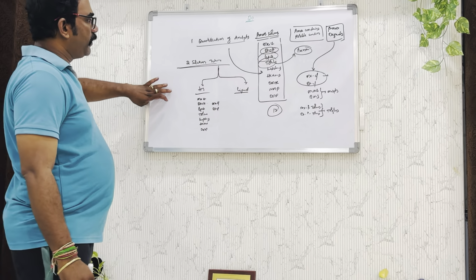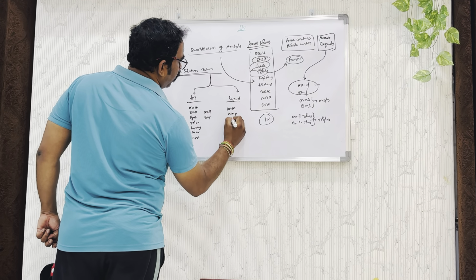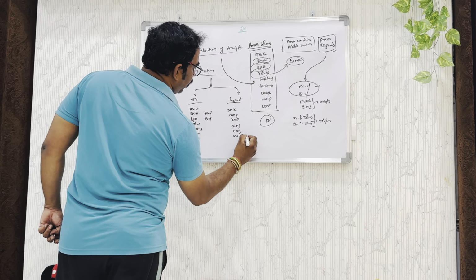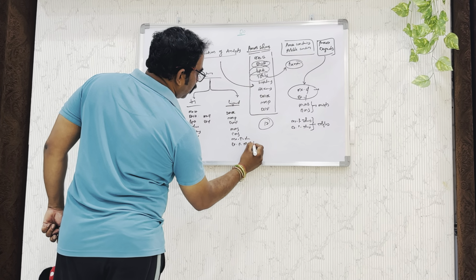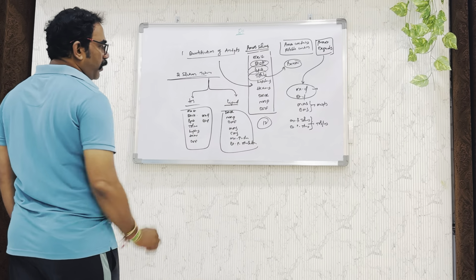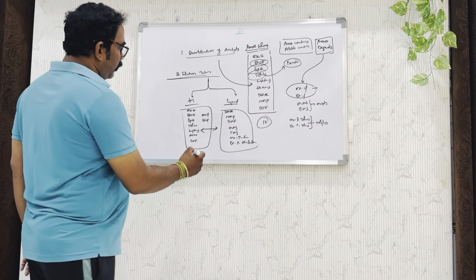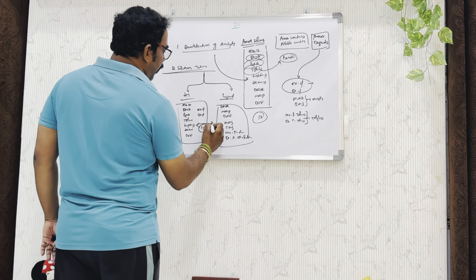DMF also we can analyze. If it comes to liquid: DMAC, NMP, DMF, MMS, EMS, methyl para-toluene sulfonate, ethyl para-toluene sulfonate. These have comparatively higher boiling points, above 150 degrees, while the headspace solvents have a boiling point below 150 degrees.